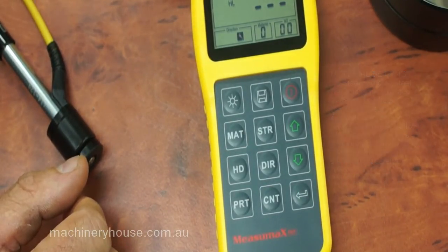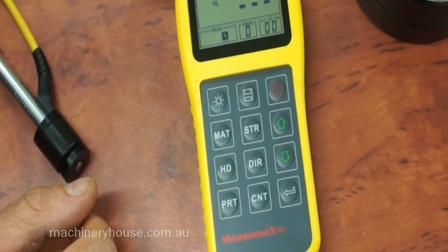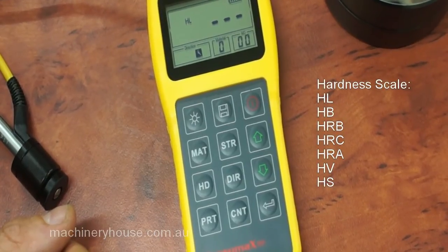HD button. Pressing the HD button will allow you to toggle through the hardness scales of your choice. Please note the scales available are related to the material selected and the probe.